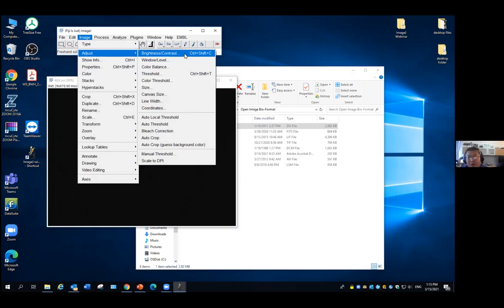So you may wonder, how do I know where all those 3 functions are? Unfortunately, there's not a simple way to know this. You just need to practice more. In the folder, I have a file called simple functions, which lists about 30, I think, of the most commonly used functions in ImageJ. You can use that as a reference. But later on, once you practice on the software more, you will know where to find those 3 functions.